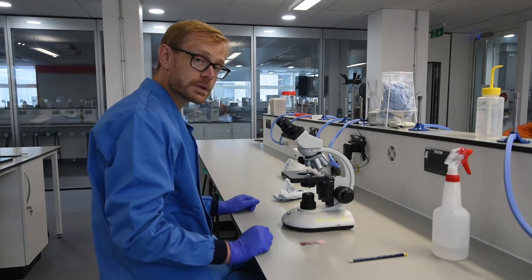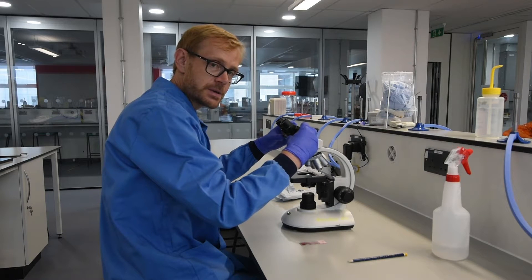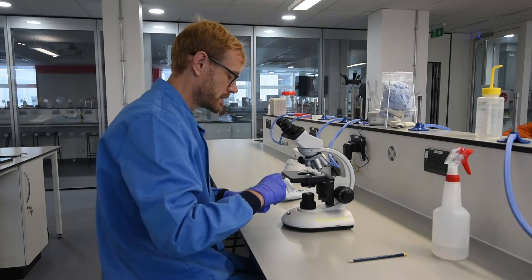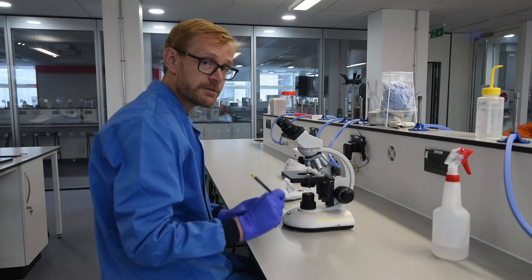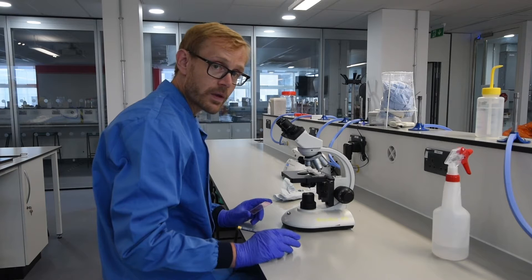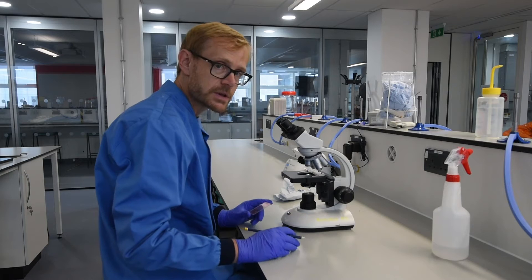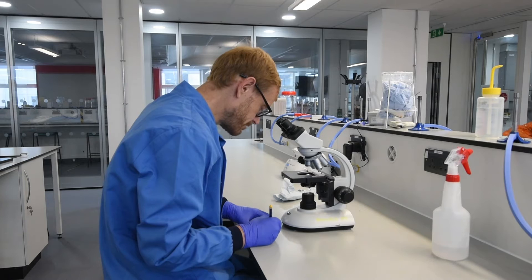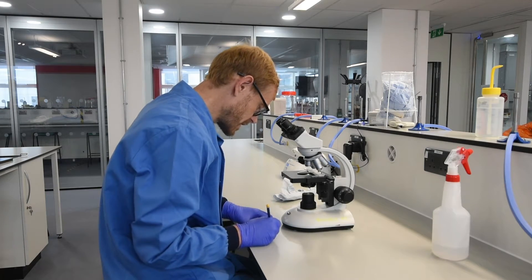Please have a look at Paul's microscopy video from induction week on how to set up the interpupillary distance for yourself on the microscope. We have the preparation that we've just made. The thing we need to do is actually write what that preparation is, so when you come back in a few days or months time you know what's on that slide. We're going to put 'onion root tip, orcein stain' and the date.